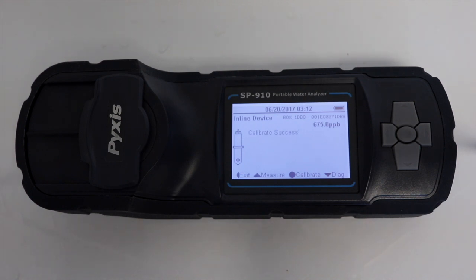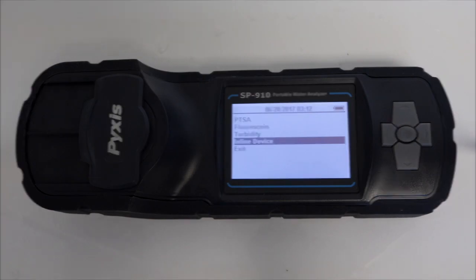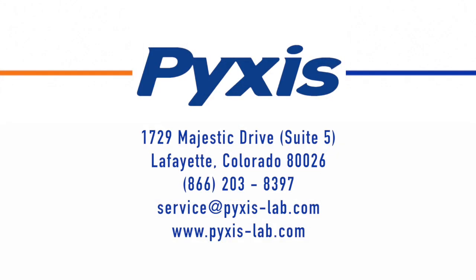The Pyxis SP910 has now wirelessly calibrated the ST500 probe.